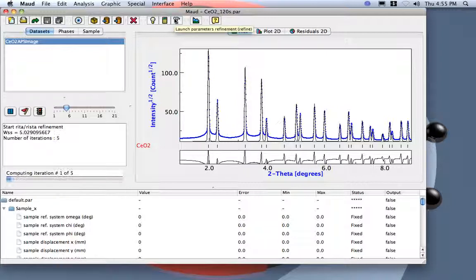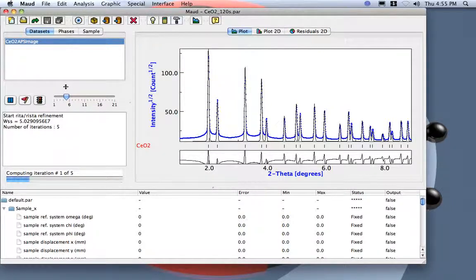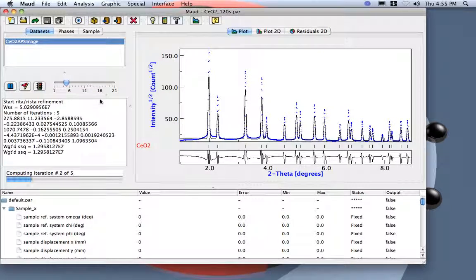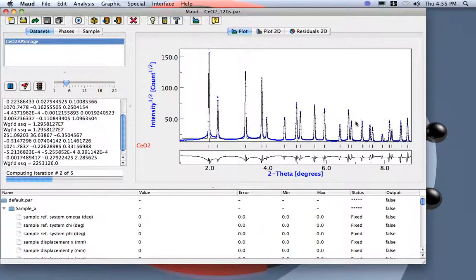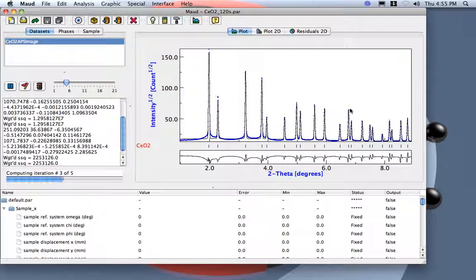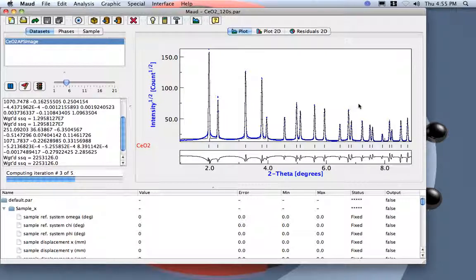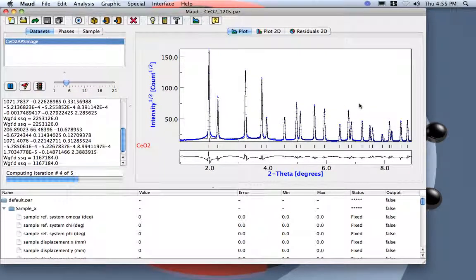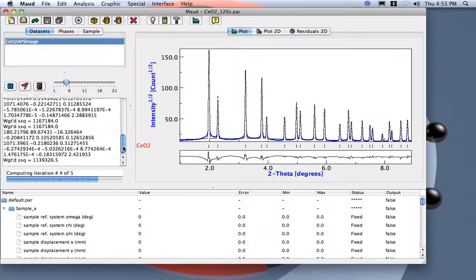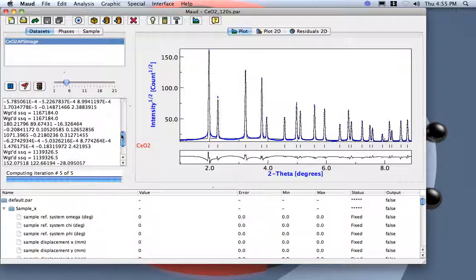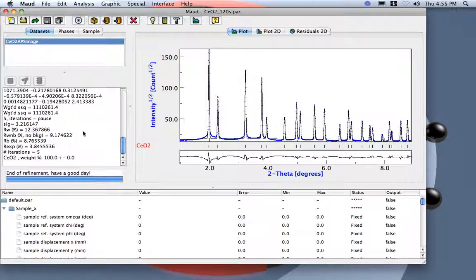Let's start. Now the MAUD starts to refine, and we can see the progress over here. Second iteration already started, we start to get something good. Maybe better. Good, still it's not something we can use.